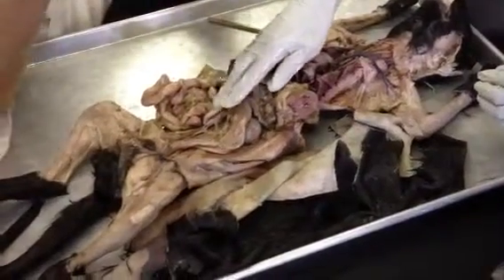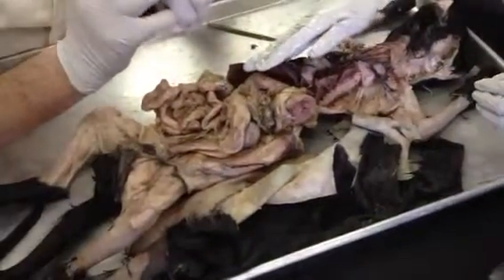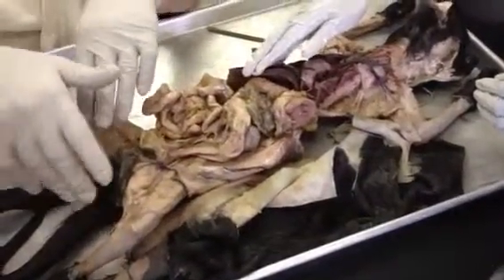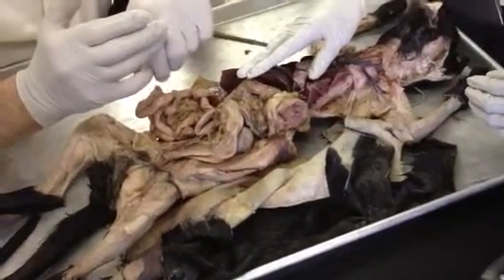Now the end of the large intestine is the anal canal that we don't have opened up and aren't going to open up. And then the very opening at the very outside is the anus, which we're also not going to explore. But I do want you to know about them.